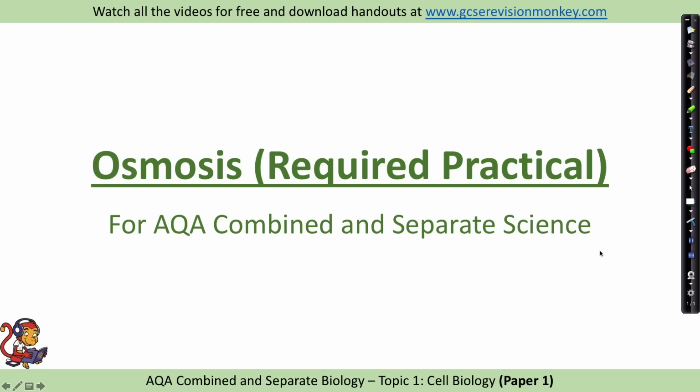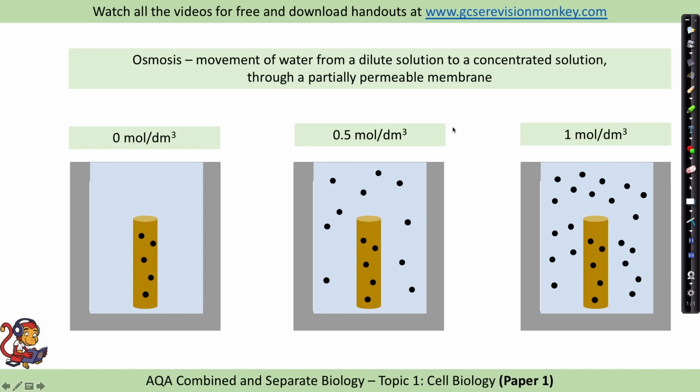Osmosis required practical. So let's start by reminding ourselves of the definition of osmosis. Osmosis is the movement of water from a dilute solution to a concentrated solution through a partially permeable membrane.